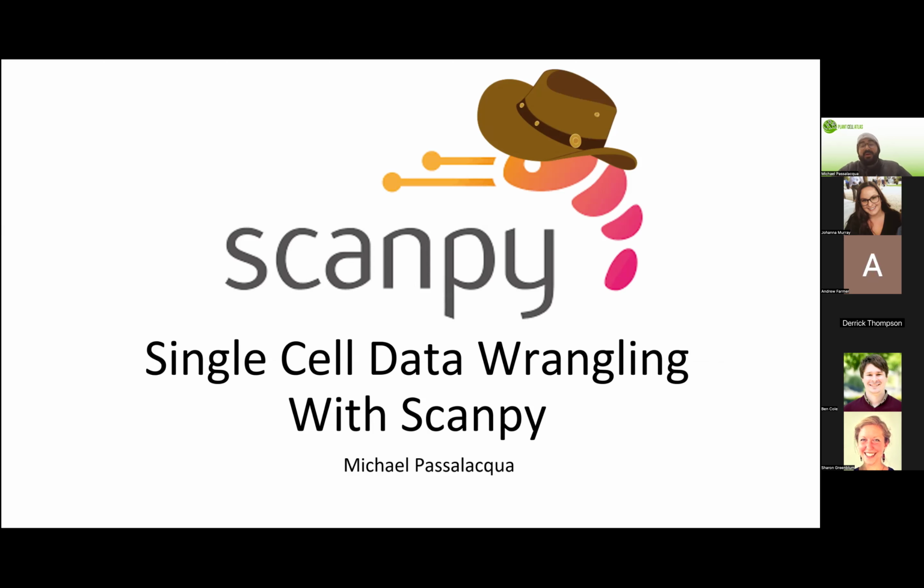So I'm Michael Passalacqua. I'm a postdoc at NYU, where I work with Joy Bergelson on NLR genes, studying which plant immune hubs they interact with using single cell data, and a lot of co-expression. And today I'm going to be going through using ScanPy to do some data wrangling and walk through what ScanPy is, how you can use it to interact with single cell data, some tricks that are helpful and things to watch out for when you're using ScanPy with single cell data.